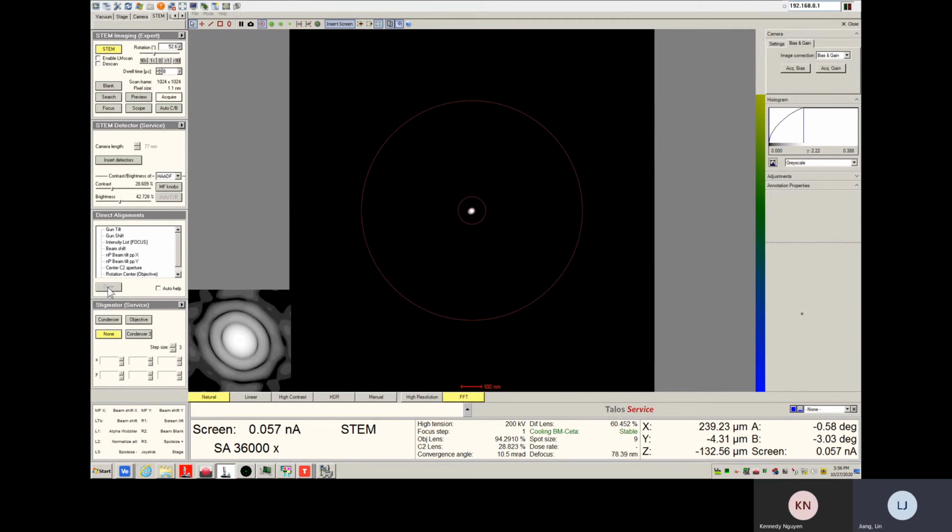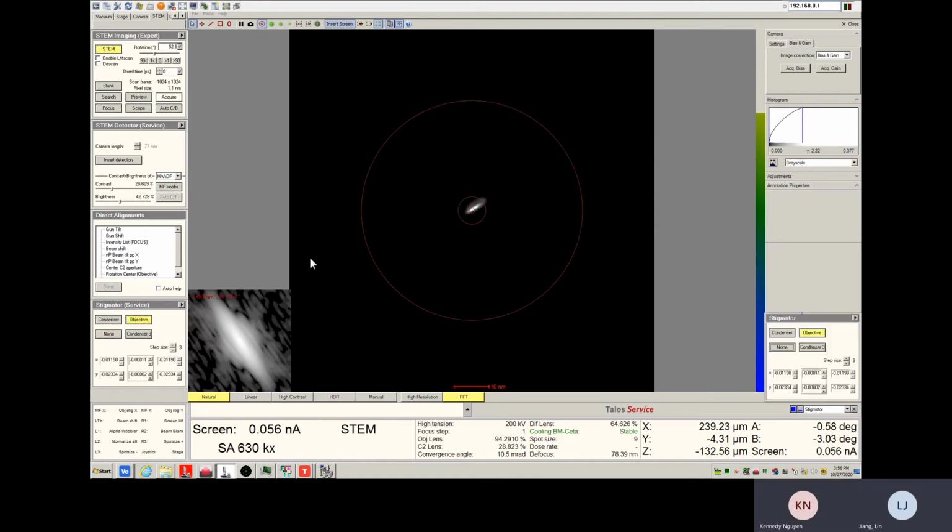It's been saved for a long time, maybe. So that's the reason. Oh, actually, it's way off. That means we need to go out of direction to take a look at your probe and do some fine adjustment. Now it seems we have a lot of condenser objective stigmation to make this one round.